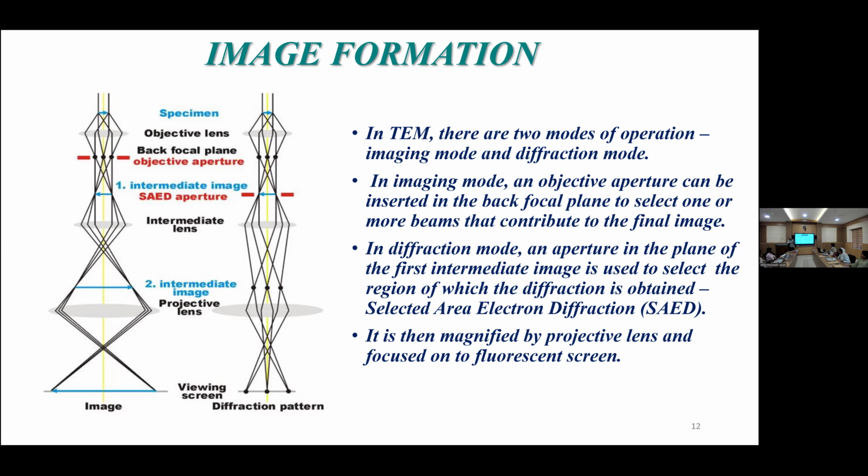But in SAED, what is happening? Source, sample, then scattering is there. So the beam is scattered to another axis. So we place detectors or an aperture there, and then we collect all that information. The scattered electron information is carrying crystalline information of the sample. For a crystalline sample, we will get selected area electron diffraction spots. Okay.